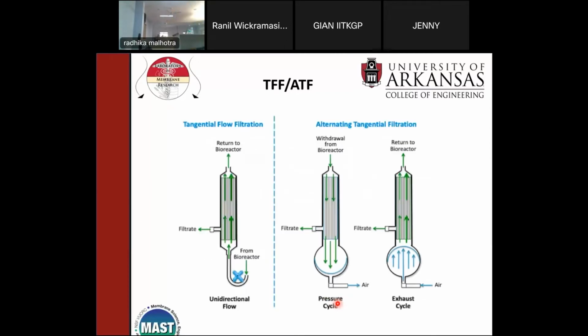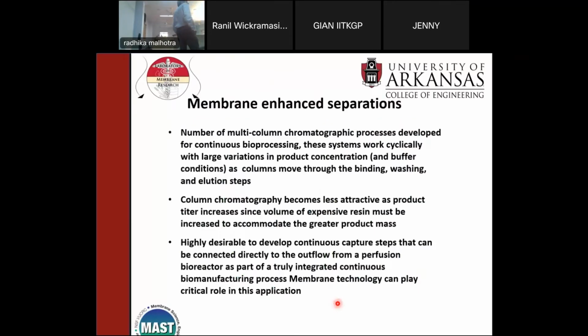So what it's saying is that if you're pumping this way and you have a large flux going out, okay, at some point, because remember you need conservation of mass, the volume decreases here, you start to get reverse flow going back in from the other direction. Okay. Now, the downside of that is that the permeate to recover is less because some of it's going back in. But the good thing, it's actually backflushing the membrane and cleaning the membrane. And as mentioned earlier, it does operate at very low permeate flows, but that's okay because we don't mind. We want to run it as long as possible. So that occurs in this. Okay, this flow.